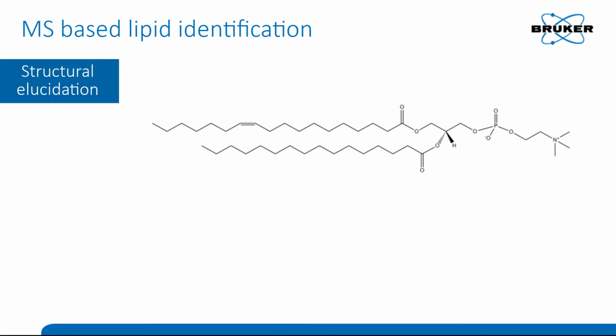When we now detect this molecule as an M+H ion with a modern TOF-MS instrument, we can predict the molecular formula based on the acquired accurate mass-to-charge ratio. This information alone leaves us with the problem that we cannot distinguish between occurring lipid isomers, for example here phosphatidylethanolamine 37:1. Next to isomers, also isobaric interferences from various formed ions in the electrospray interface are creating an additional challenge. For example, in the case of PC species, the formation of sodium adducts. Many of these challenges can be solved via MS-MS experiments.